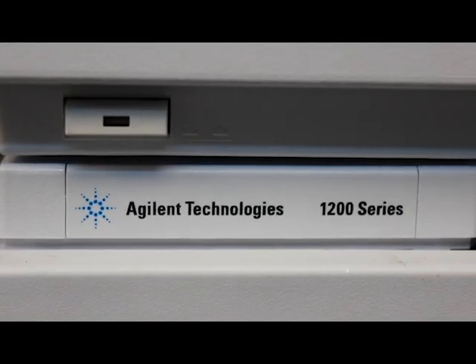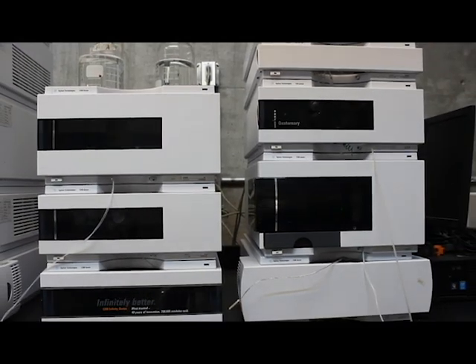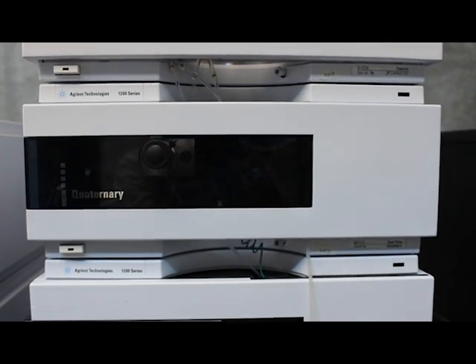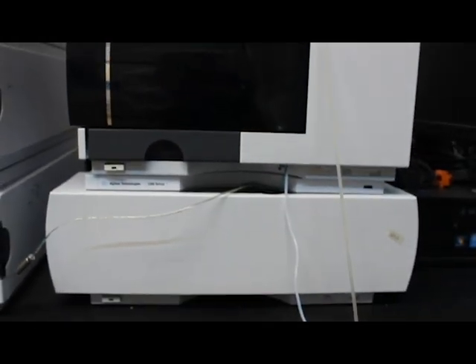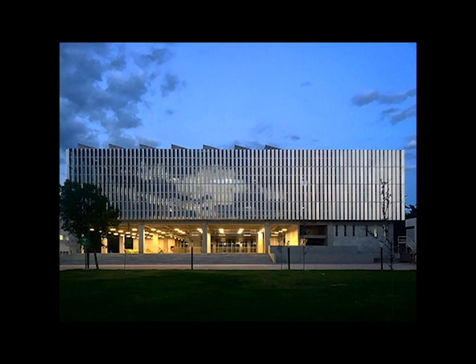The Agilent 1200 series is an HPLC system coupled to a diode array detector. This system consists of a vacuum degasser, a binary pump, an autosampler, a thermostated column compartment, and a diode array detector. In Campus Querétaro, this equipment is used mainly for the analysis of phytochemicals. We would like to share with you one of the current applications of this system.